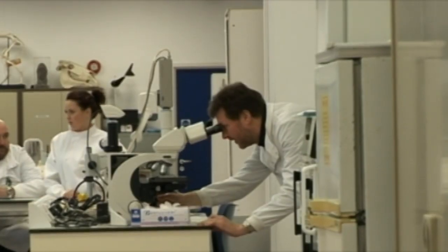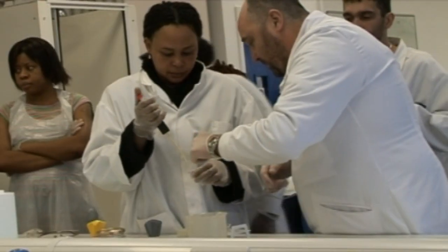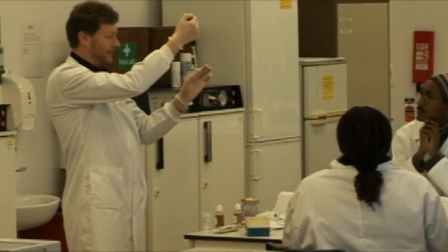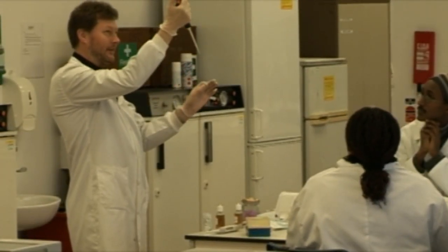We start out right at the beginning of the day with a set of cells which they can actually have a look at under the microscope and they can see that they're live cells. They go through all the different stages of extracting DNA and using a technique known as the polymerase chain reaction. We give them a couple of unknown samples at the beginning of the day and by the end of the day they can tell which one is which using their DNA fingerprinting technique.